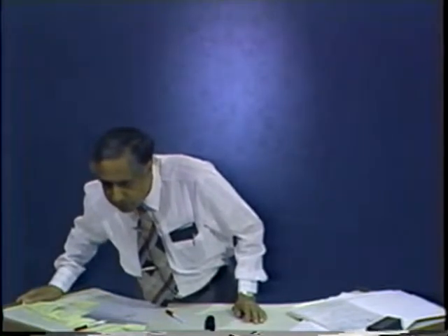Yes, please. When you introduce the spin density matrix sigma on page 2.4, you write sigma equals the trace over f of rho. I really miss the point: what does the f mean? Are those the free evolution degrees of freedom, or what is it?